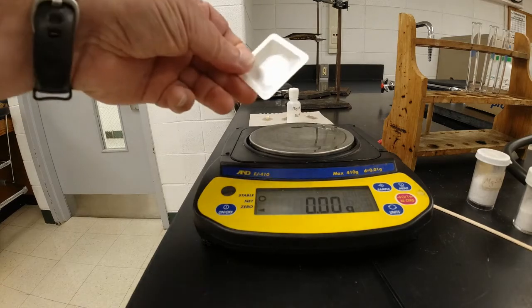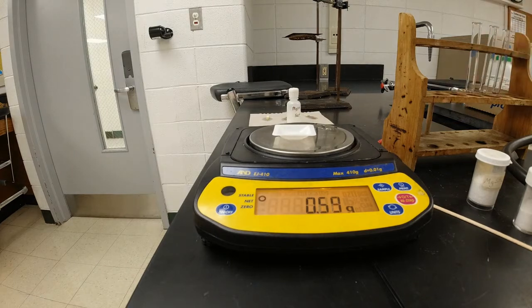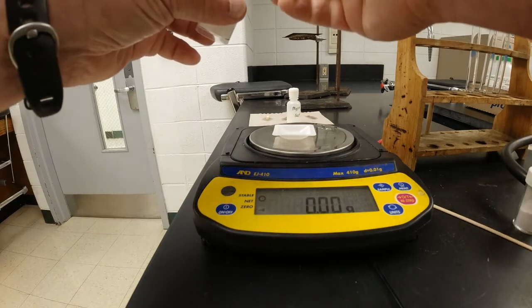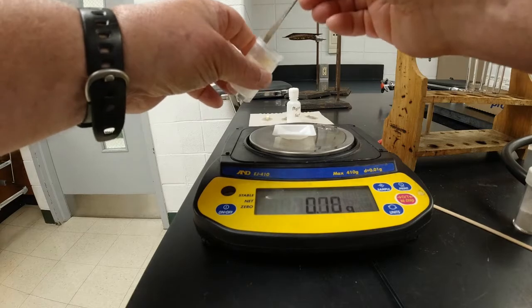So what I have here is these little plastic dishes, and I put that on, that changes the mass. The cool thing I can do is push that red button, it's called the tare button, and what it does is it goes to 0. And so now whatever I add on there is going to be the exact mass of the powder that I want. So I'm going to put a little bit on here, and I'm going to need way more than that.